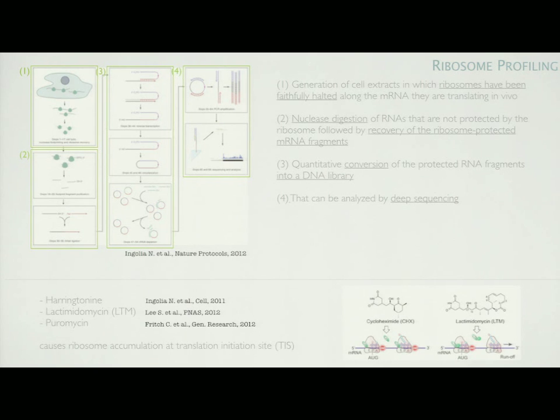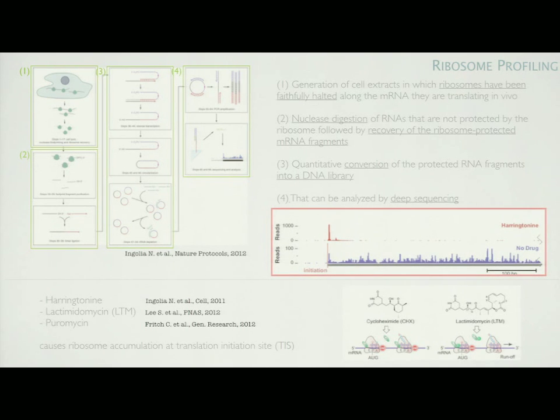There's two types of ribosome profiling. There's the normal type, which would give you this blue signal. The cursor doesn't work either. Which would give you, it's even better now.